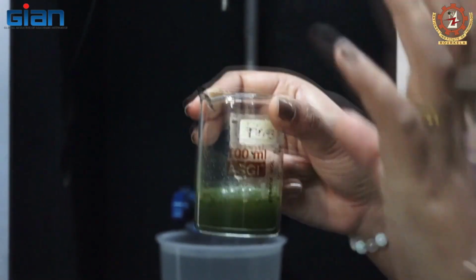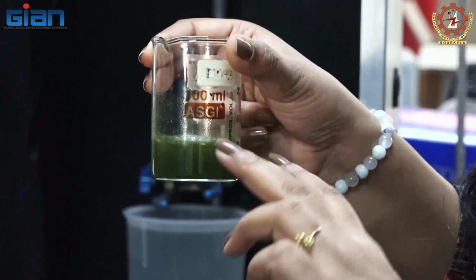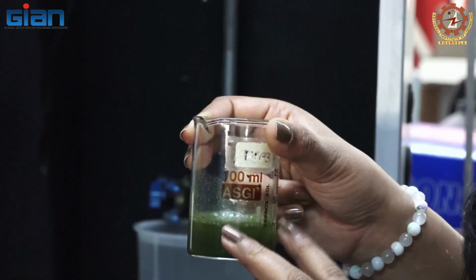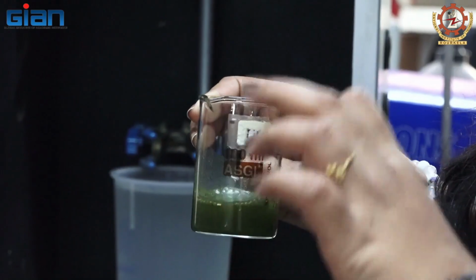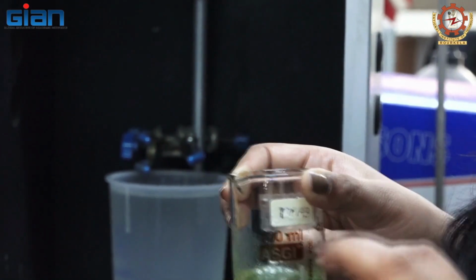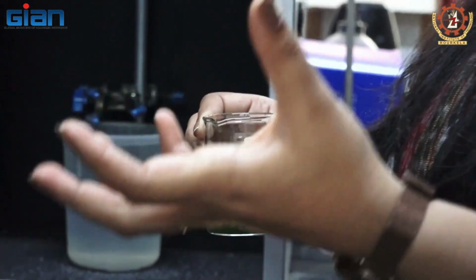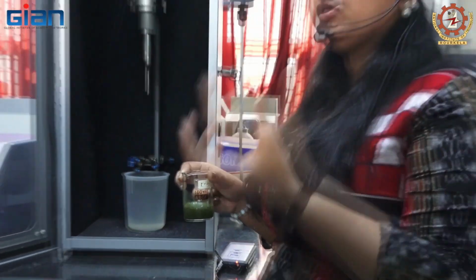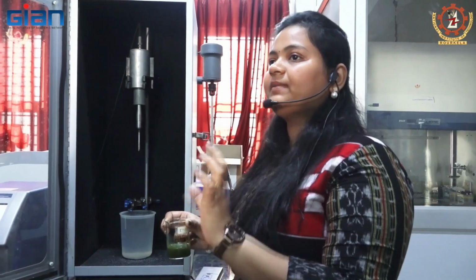I took 2 grams of bay leaf dry powder and 30 ml of water, because I have already optimized it in the design software. In the software you can choose how many independent variables and how many dependent variables you take, and on that basis you can optimize the condition.